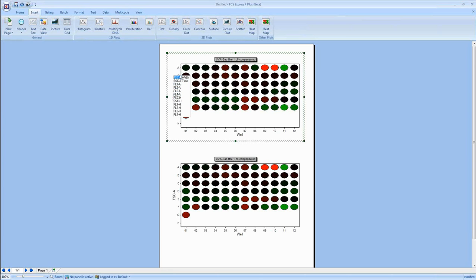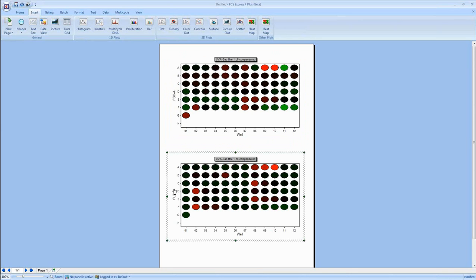And you notice here, this is flow cytometry data, so we have forward scatter, side scatter, 4 different fluorescent channels in the area and the height parameters along with width and time. And if we wanted to change to FL2, we can change to FL2, and you'll notice that this is going to be updating the heat map as we change between these different parameters. You can see that the colors are changing here, indicating that these parameters are changing for us.